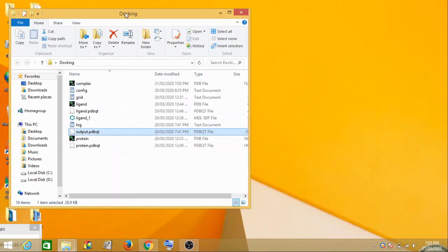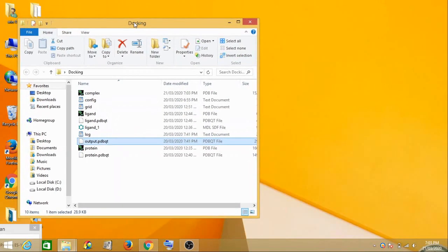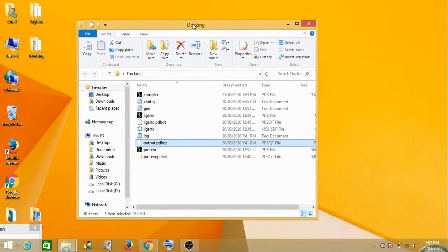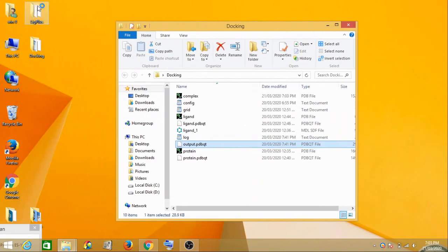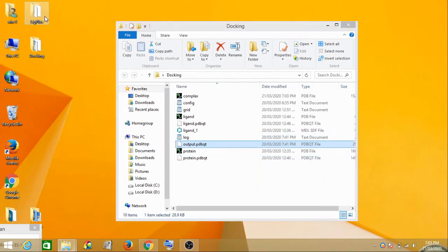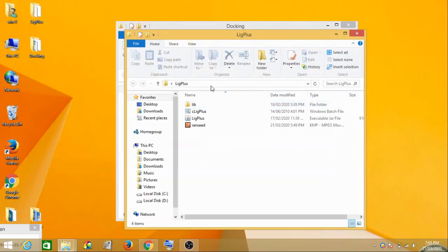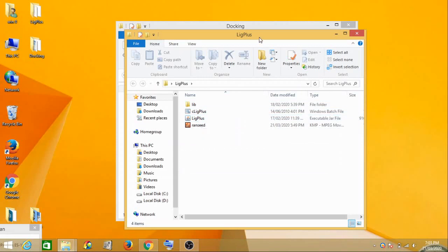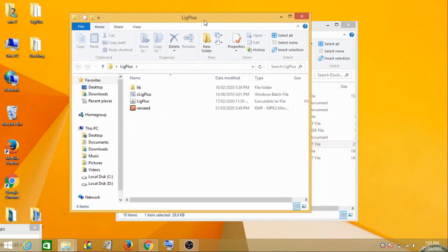Now we do not need this so we can close this. Now the tool which you are going to use here for protein-ligand interaction is called LigPlus.